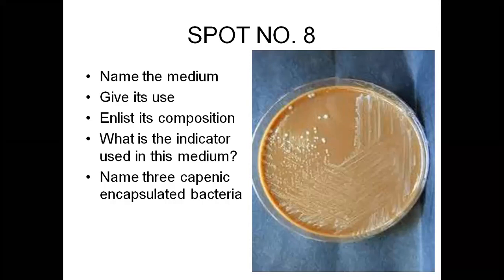That is the enough carbon dioxide which is required by these carbon dioxide loving bacteria. We are not saying that there is no oxygen. We are not saying that the environment is a vacuum. It is only that carbon dioxide is more than the normal environmental carbon dioxide. These are important bacteria, and they cause infection in the genital tract, in meninges, in the respiratory tract.